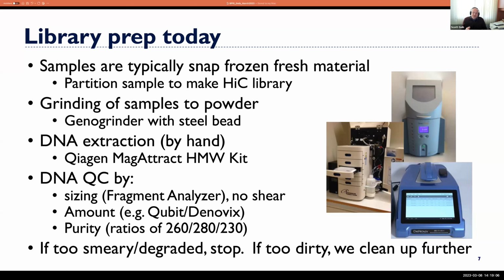So when you're shearing the DNA, you have to have that DNA in a certain volume. And so one thing we do when we shear the DNA is we usually do an Ampure concentration. So we'll take Ampure beads after the DNA is extracted and reduce the volume down to the volume that we need for shearing. So that in itself is another cleanup of the DNA.